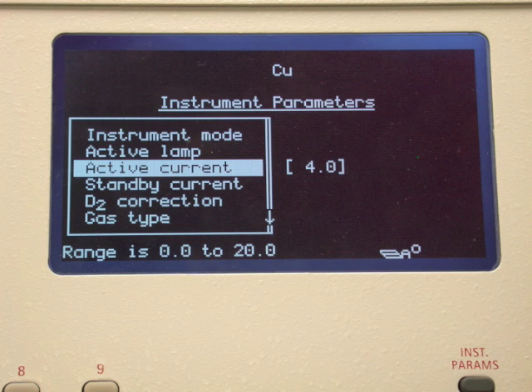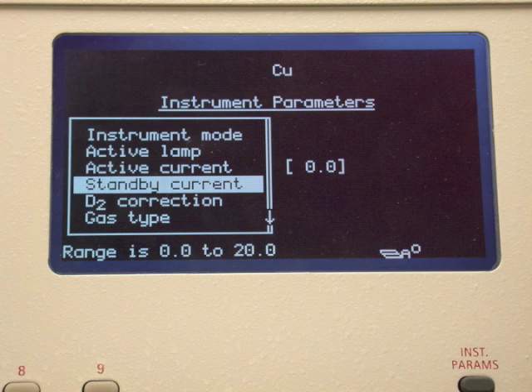The amount of current that runs through the lamp will control the intensity of the light. The higher the current, the brighter the light beam. A bright light beam helps us obtain reliable measurements; however, high currents will result in shorter lifetime for the lamp. Follow the lamp manufacturer's advice for the active current level. We will accept the default value here, as well as the value for the standby current.